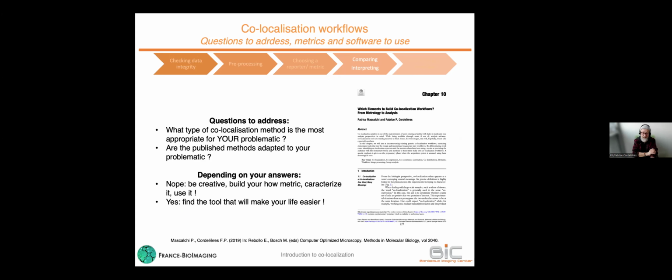There are plenty of ImageJ plugins to address the colocalization measurement. So really feel free to use the one you're more comfortable with. Don't stick to the big standards and so on.